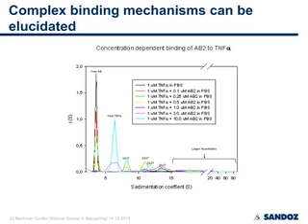And you see 1-to-1 complex forming, 2-to-1, 2-to-2, and so on. So you can really assign different complexes, and also you may be able to record subtle batch changes, because this pattern, of course, is really a fingerprint-like pattern, and it's sensitive to buffer changes, for example.